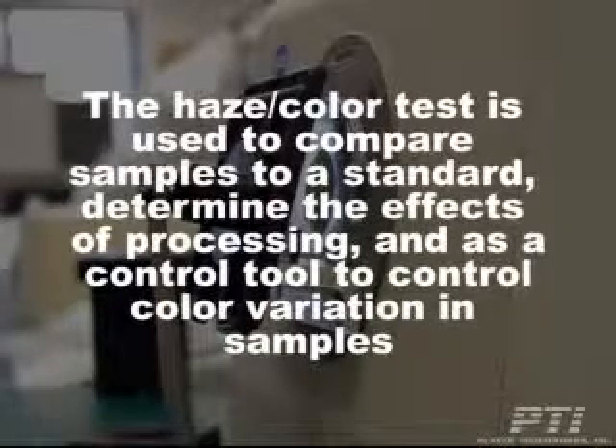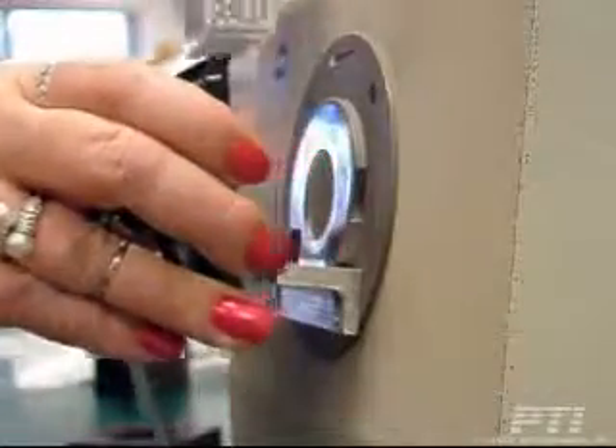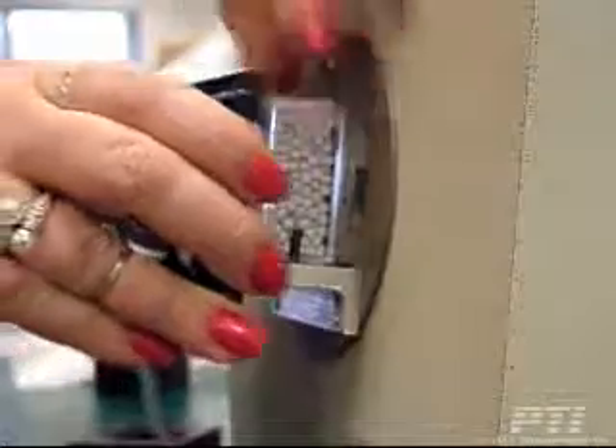The haze and color test is used to compare samples to a standard, determine the effects of processing, and as a control tool to control color variation in samples.